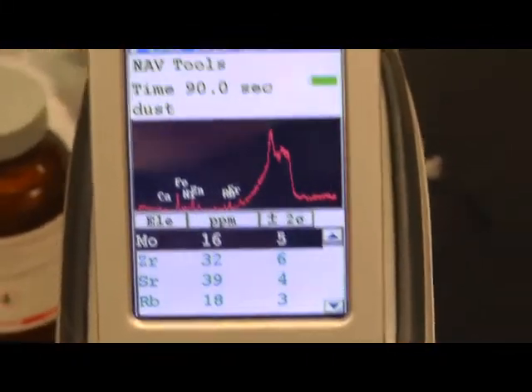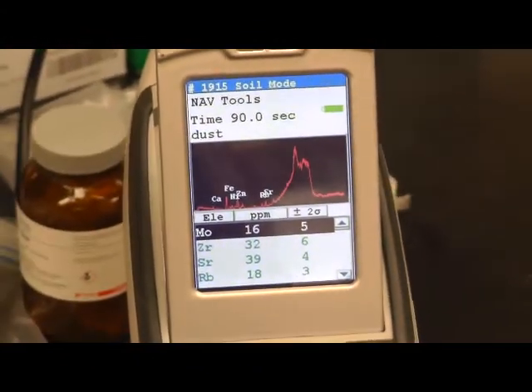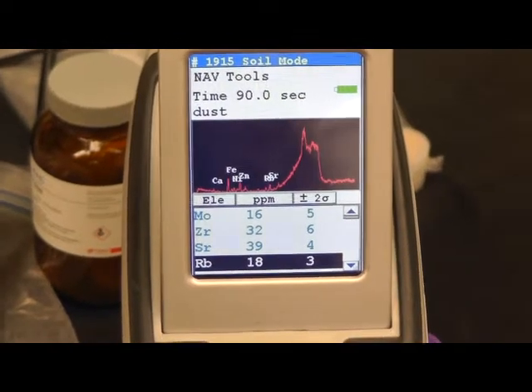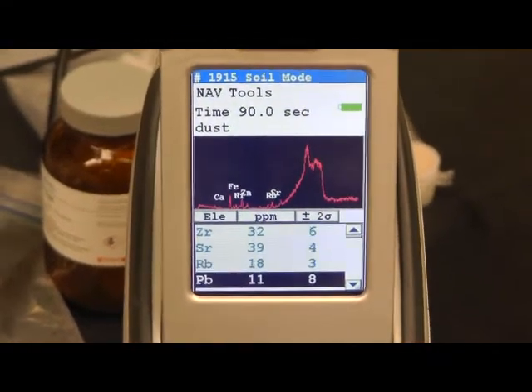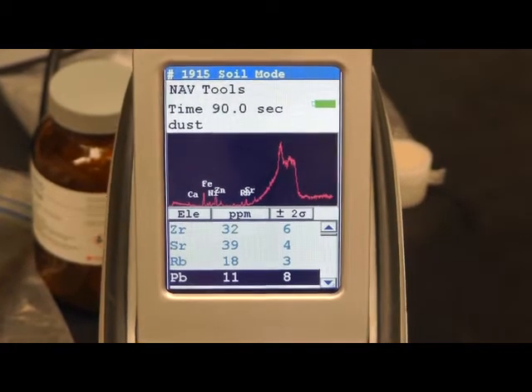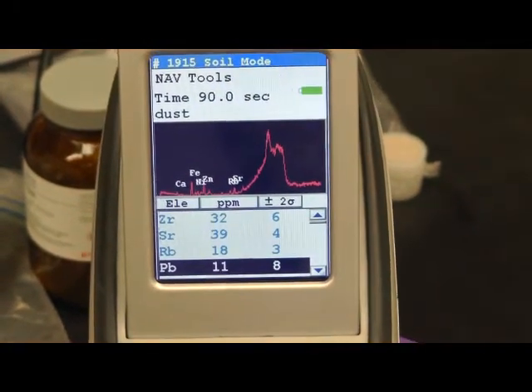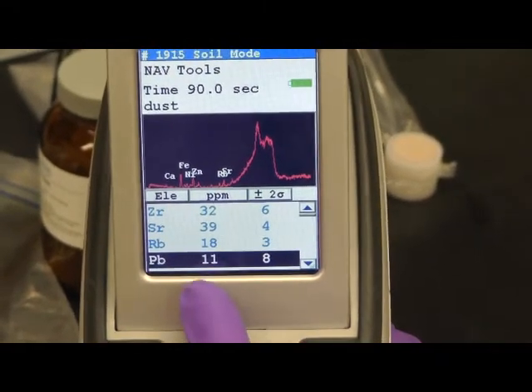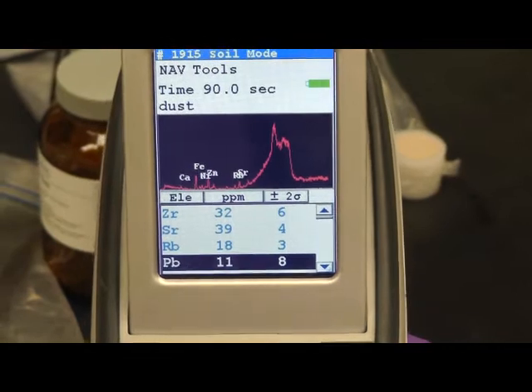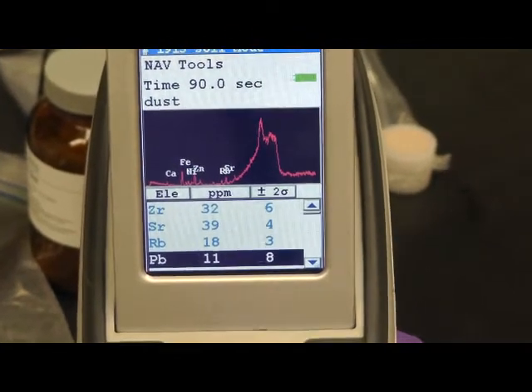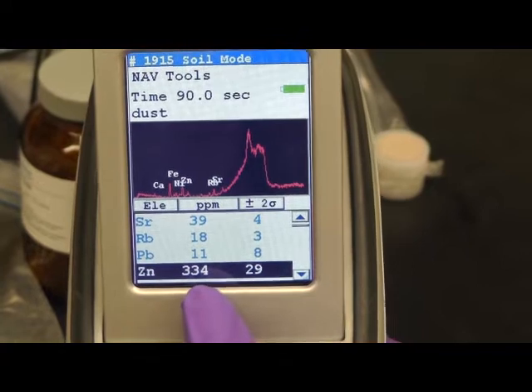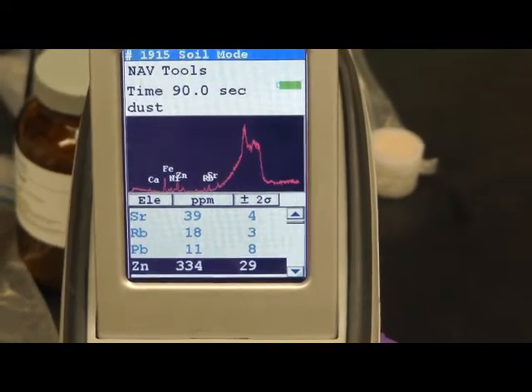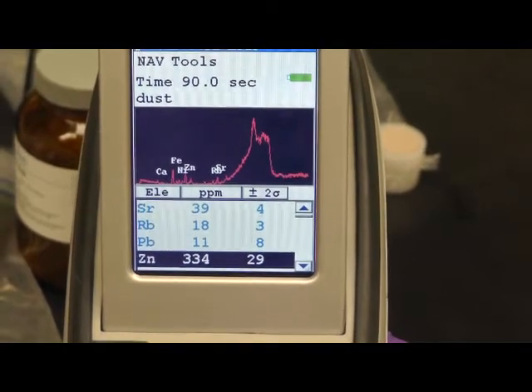Here's our measurement result for the dust samples. And then look at the number. Remember, the number of dust samples seems to be lower than the number of soil samples. However, we found certain amount of lead, 11 ppm of lead inside the dust samples. And now we found zinc, which is about 334 ppm of zinc in the dust samples.